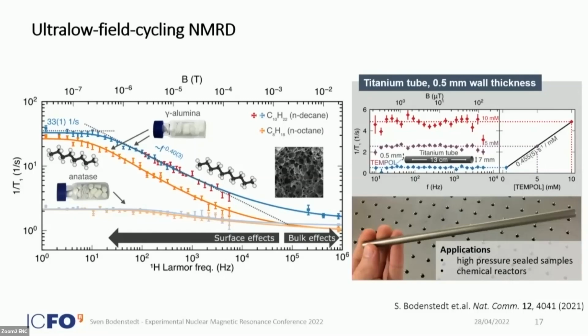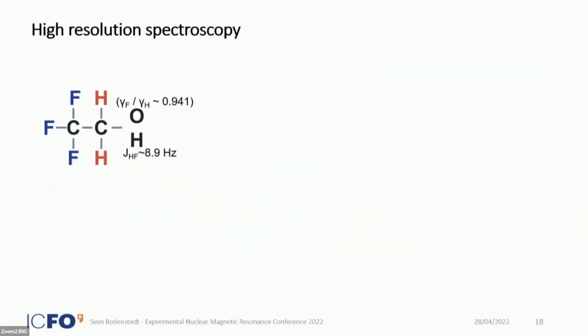And we are also able to do this within metallic containers, which offers some new applications, especially if you think about chemical reactors or high pressure sealed samples. We can do experiments with that. We also did some spectroscopy work.